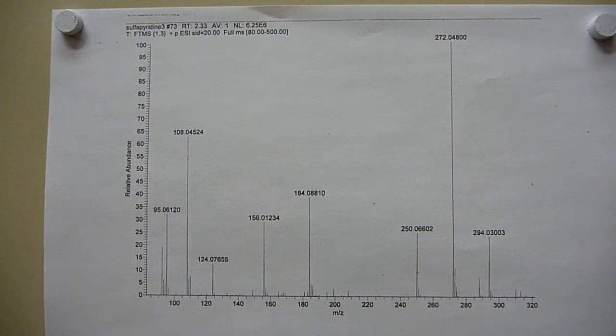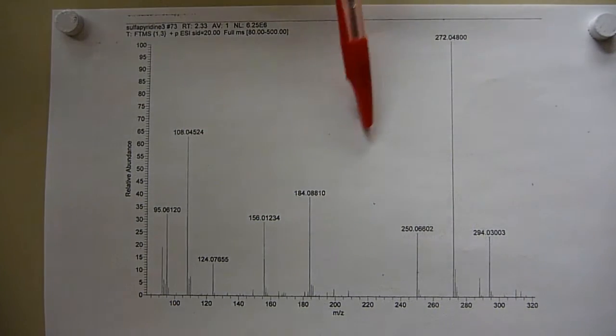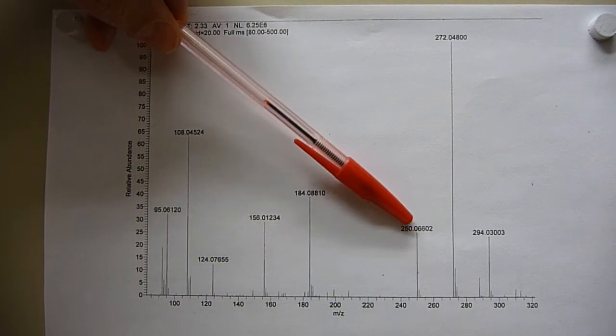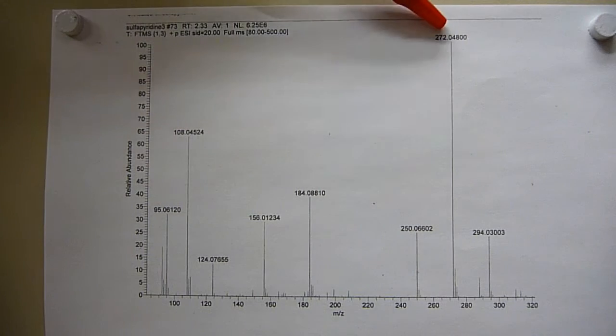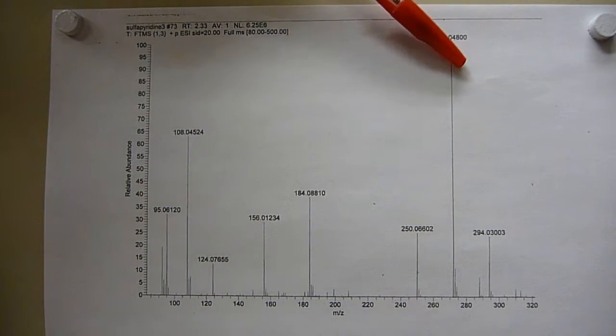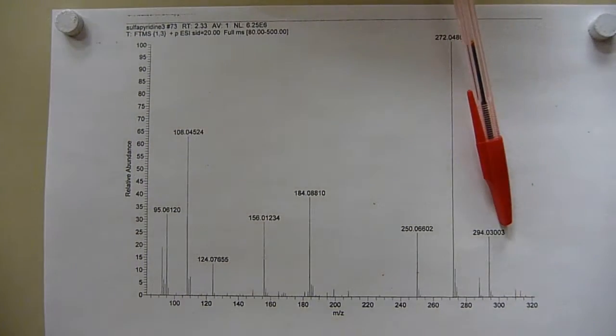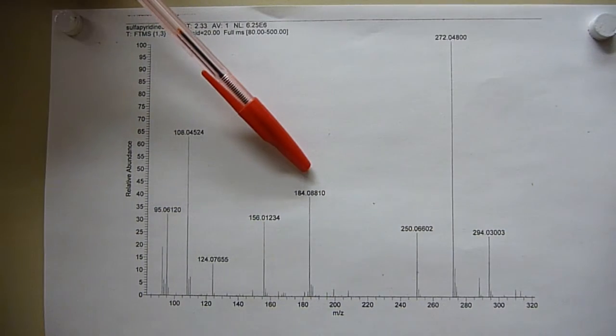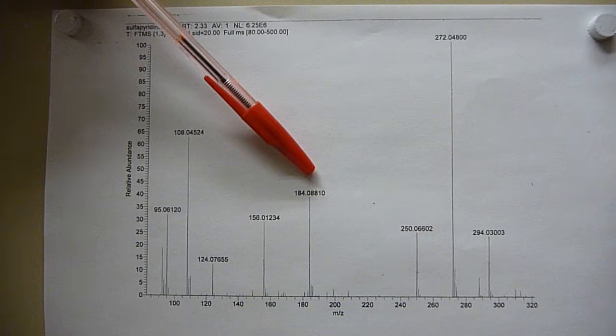This is the positive electrospray. We have the M+1, M+23. There's a sodium adduct, two sodiums, big 184.